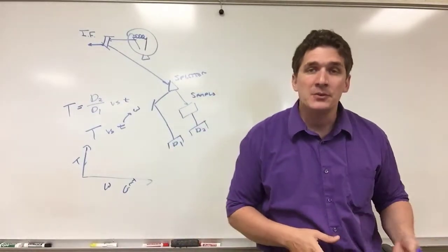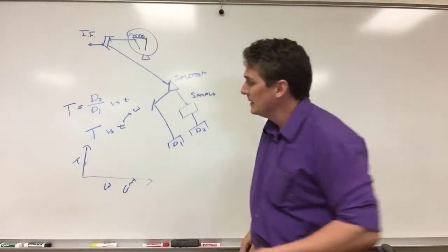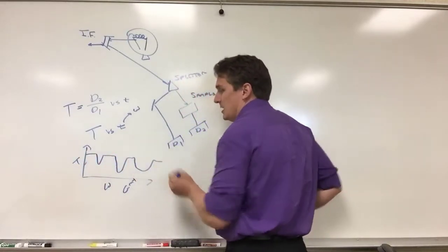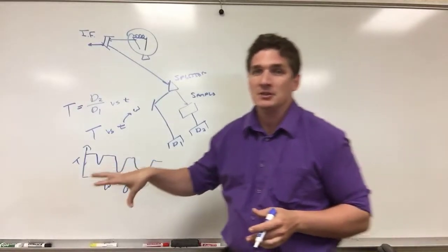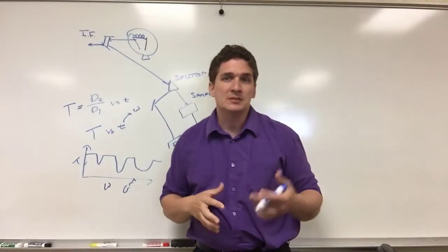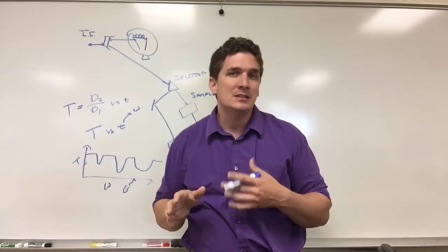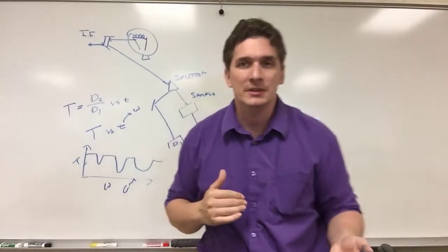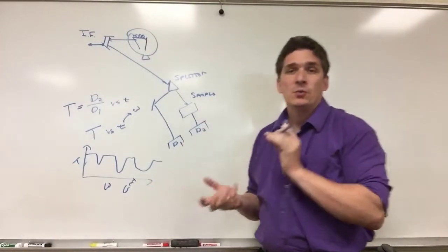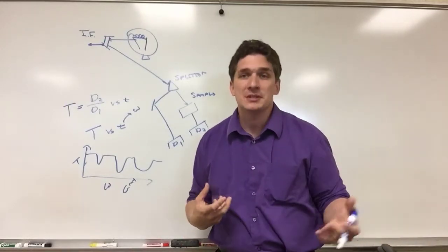There are other ways of doing this technique, but the FTIR is basically the most practical way of doing it. So this is where we're going to see transmission, and we're going to see different wavelengths and different shapes corresponding to the different functional groups within the molecule itself. Now again, we kind of need this reference spectrum so we know actually how much is being absorbed relative to the signal, because I've drawn this out kind of nice and ideally, but it doesn't necessarily mean that the signal intensity put out by the bulb is the same for all wavelengths. So this is practically what's going on in your FTIR. We're going to work primarily in transmission mode, but I'll probably put up a special video about the different techniques as well, just so you're aware of what else is out there.